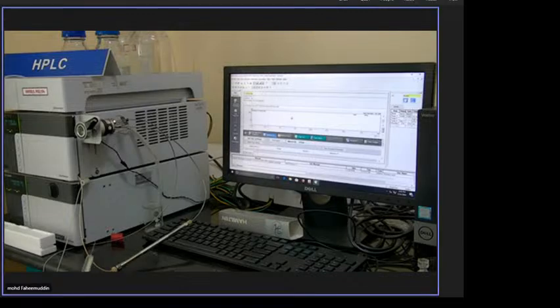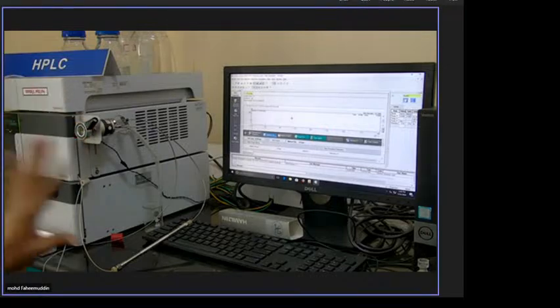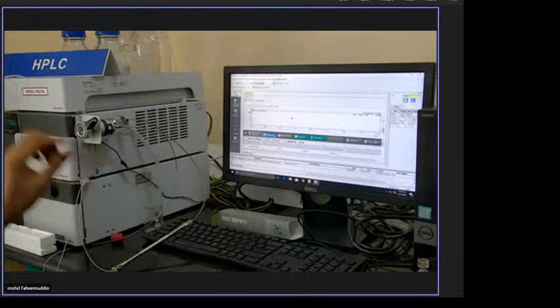So this is the needle. Okay. So there is no specific quantity we are introducing. Any quantity you can introduce. The injector will take, for example, if you are taking 10 microliters, the instrument will take 1 microliter only. If you give 1, it will take 1; 2 also it will take 1; otherwise the remaining amount will go to the drain. So that is fixed.